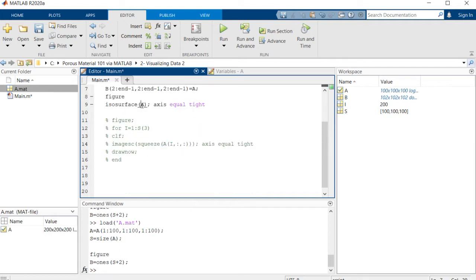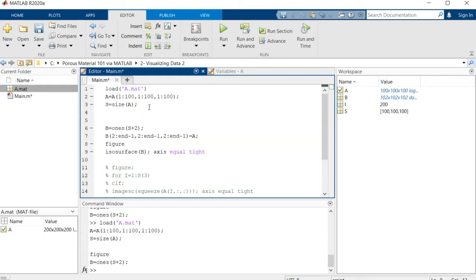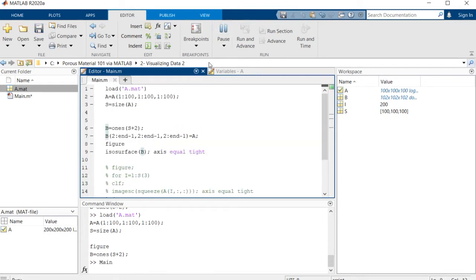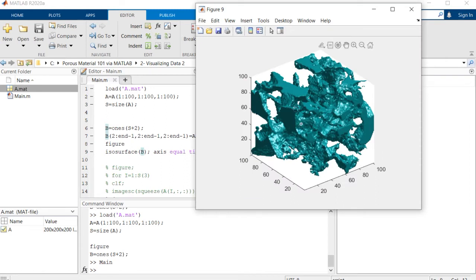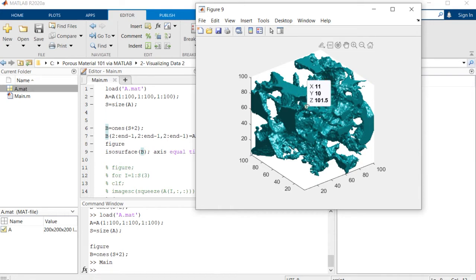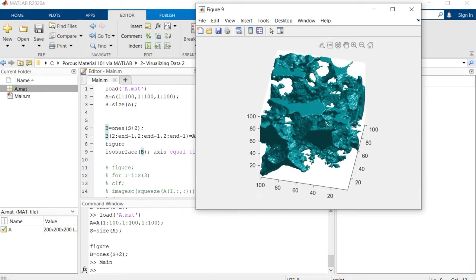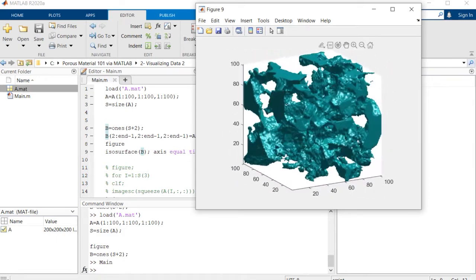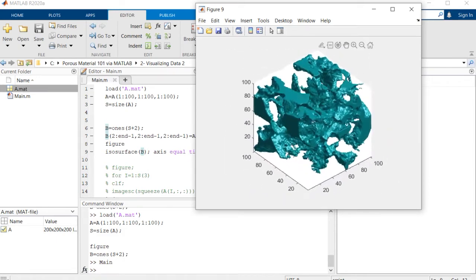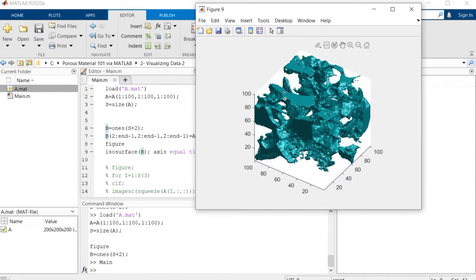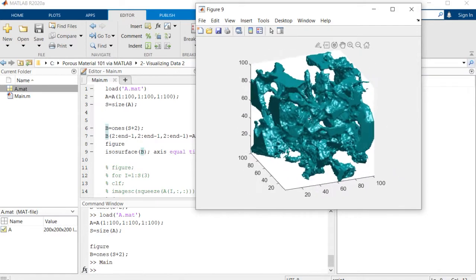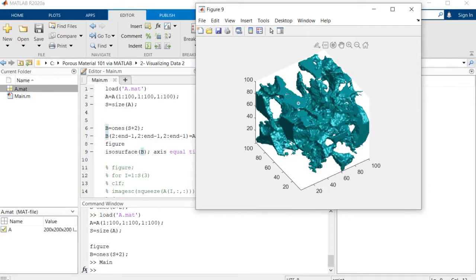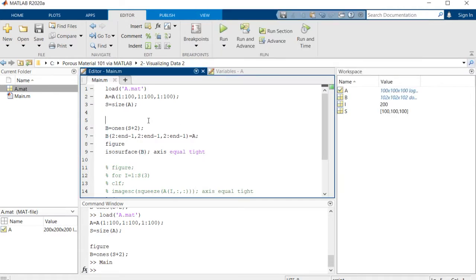So if now if we visualize b, let's see what happens. Okay, this is much better because we have a cap at the end of the open pores as you can see here, which gives us a better understanding of the 3D structure. This cap here is closing the end of the pores.